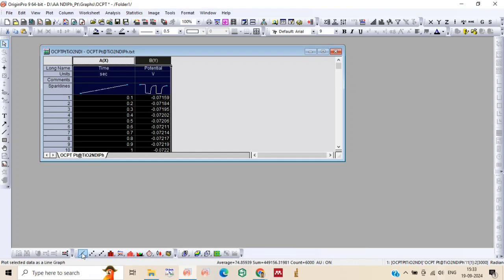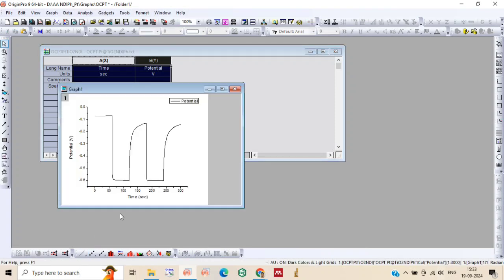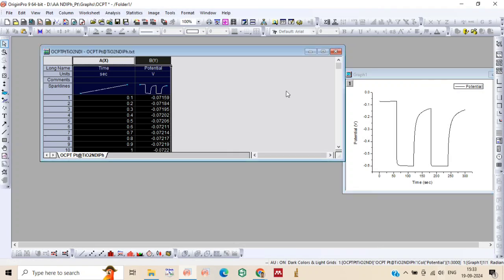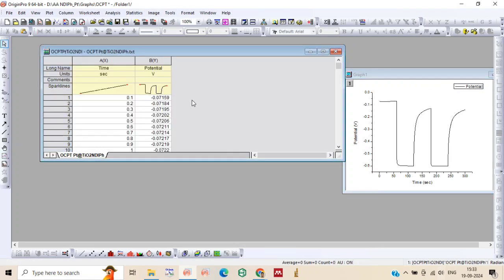Now just drag it and press this line option and you will see this is the OCPT plot which we have obtained by performing the experiment in CH instrument.